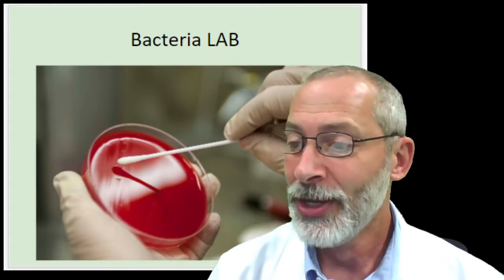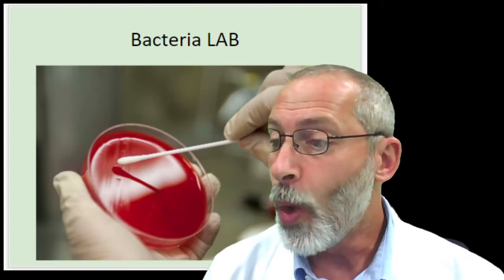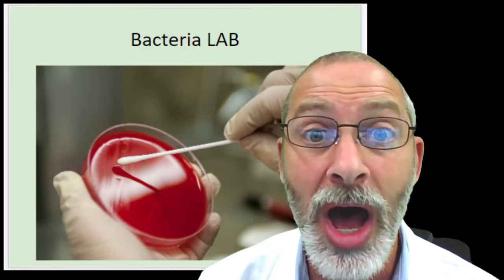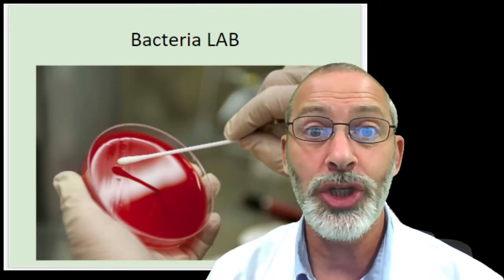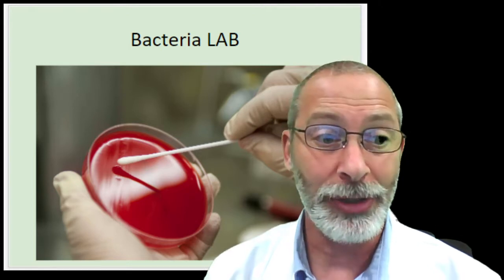All right. So the problem of today's lab is what location in the school supports the greatest population of bacteria and why? We're going to go on a mission. We're going to go on a hunt and try and find a location that has the greatest number of bacteria.